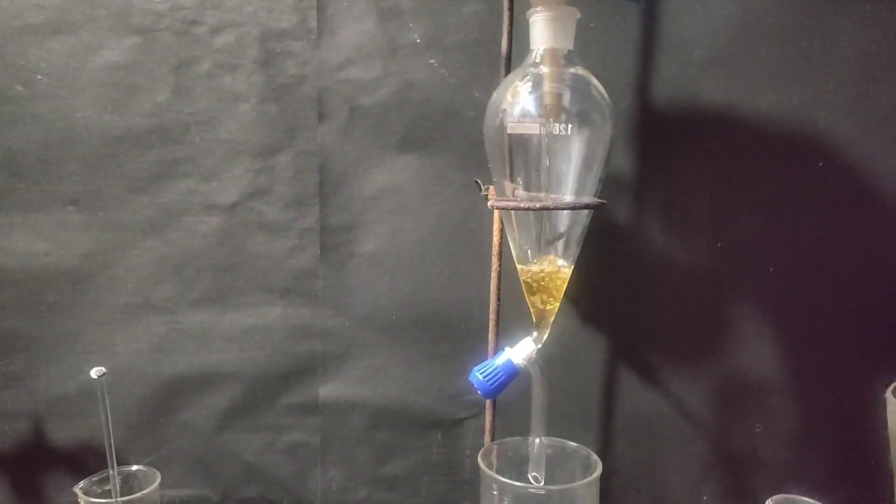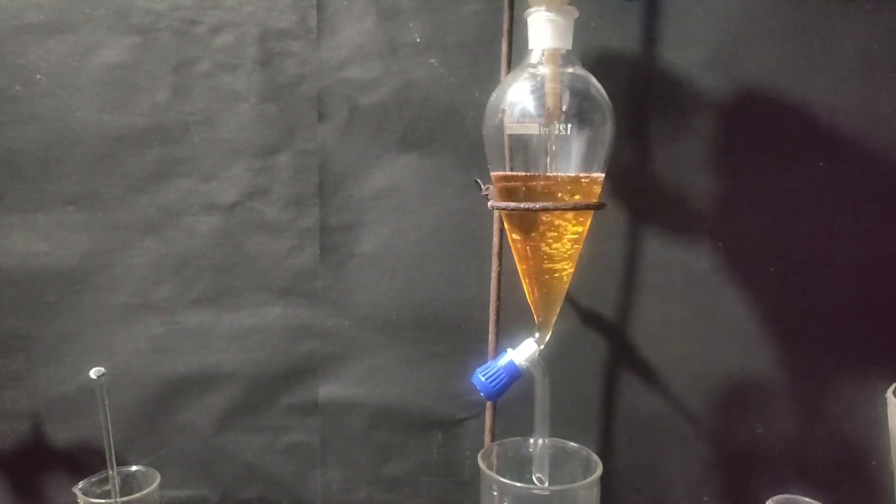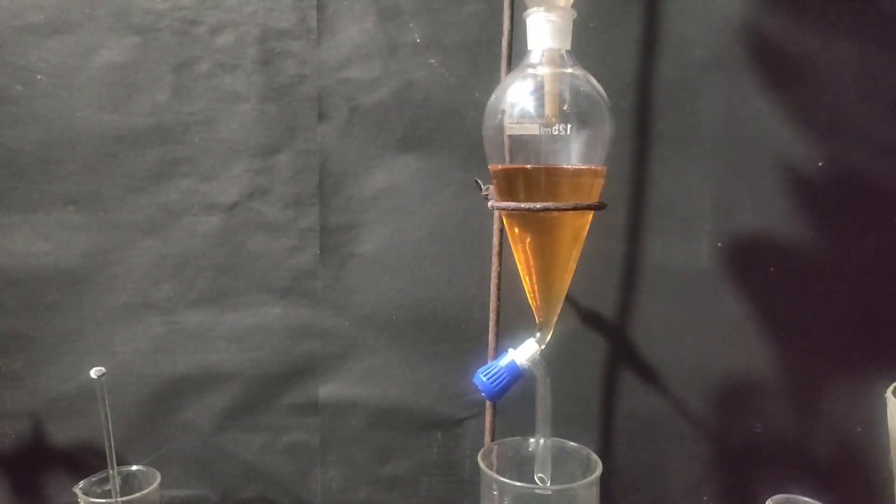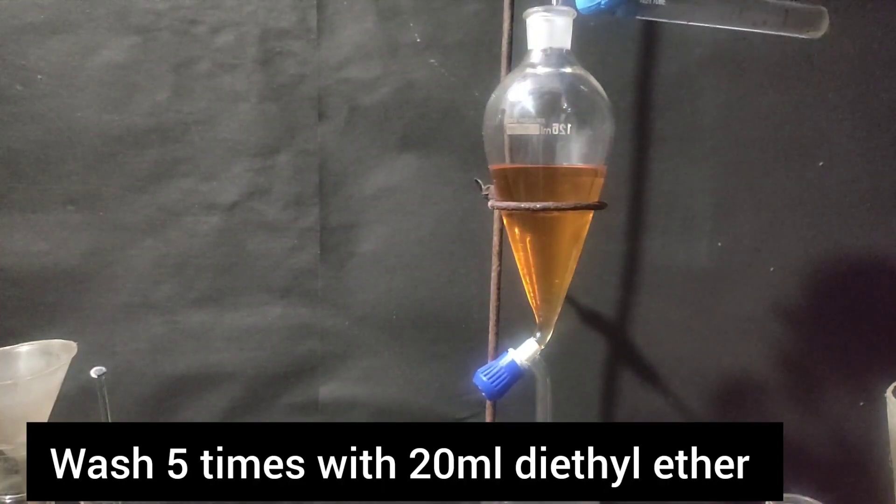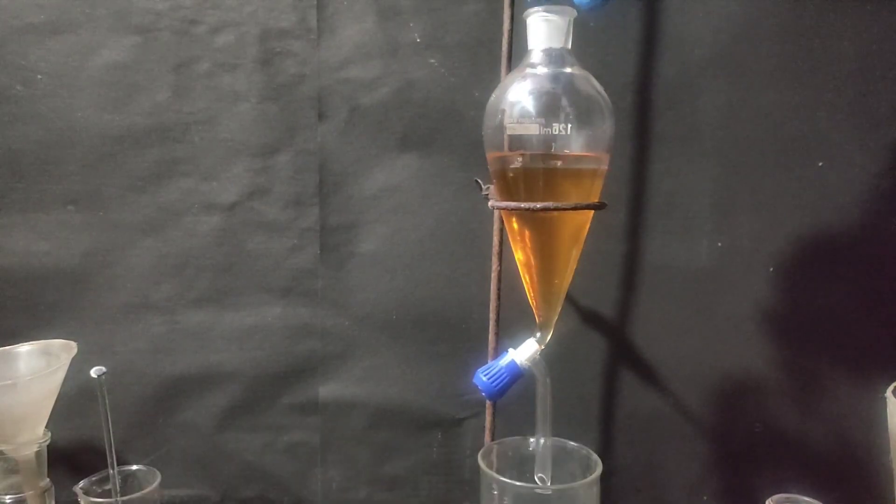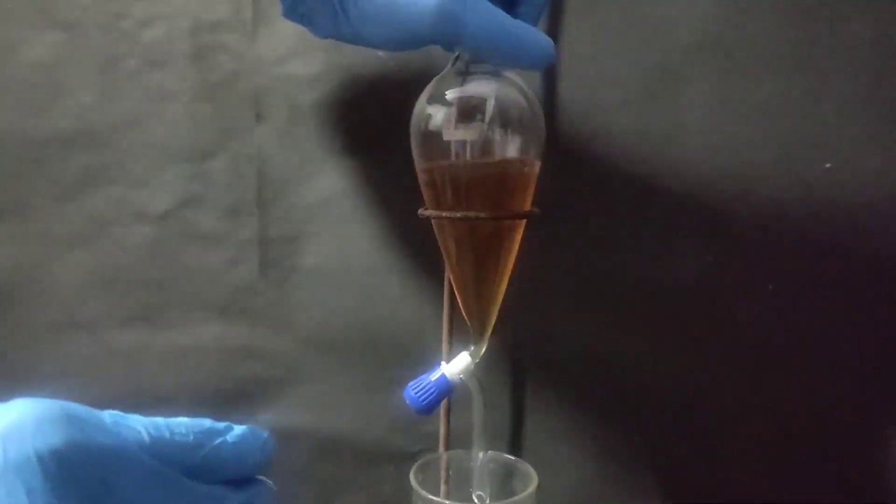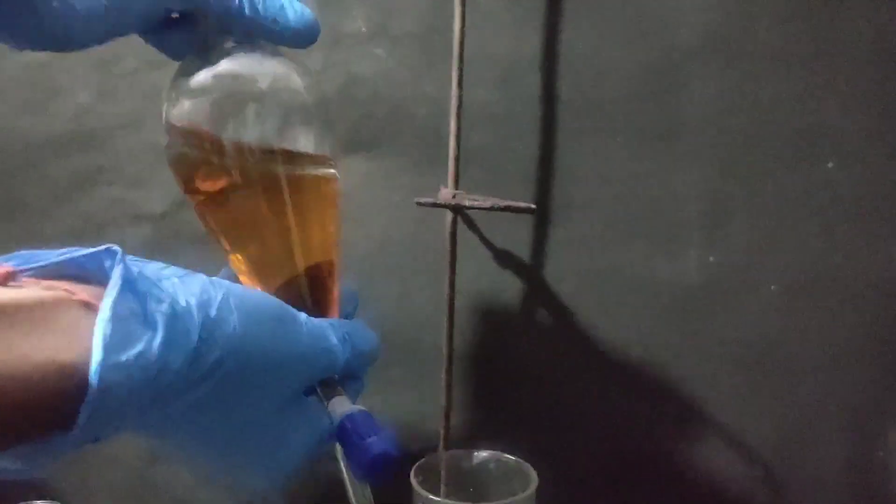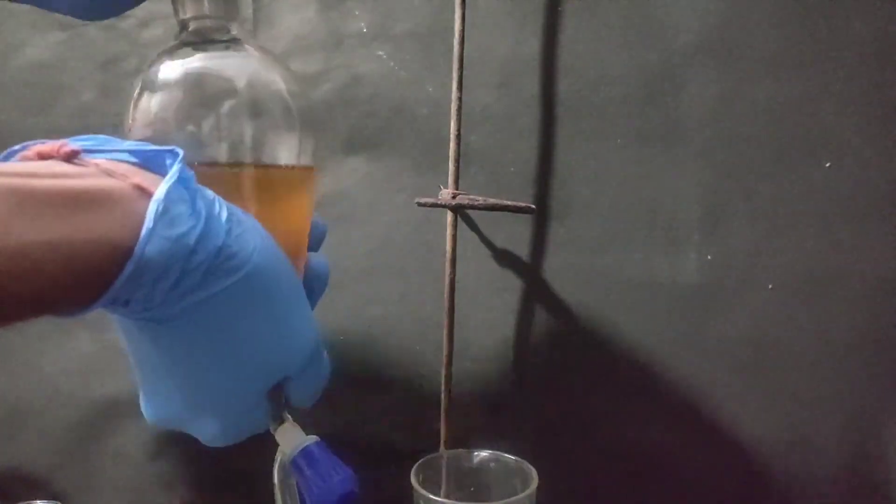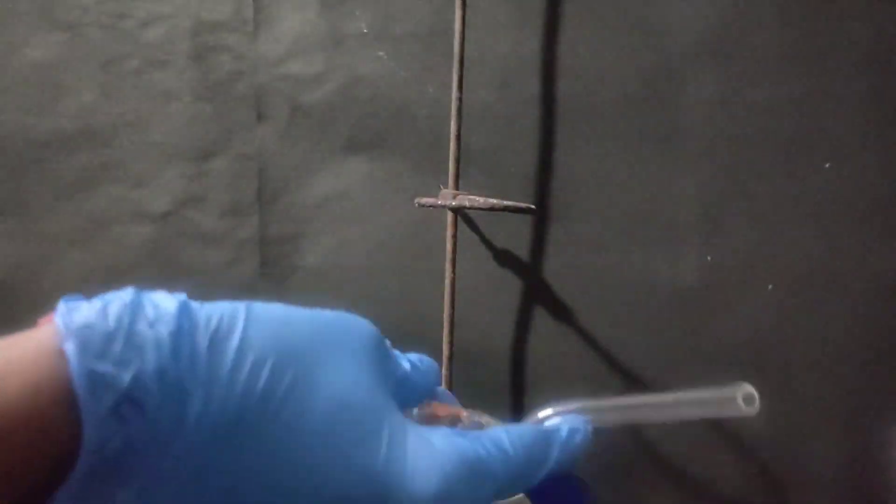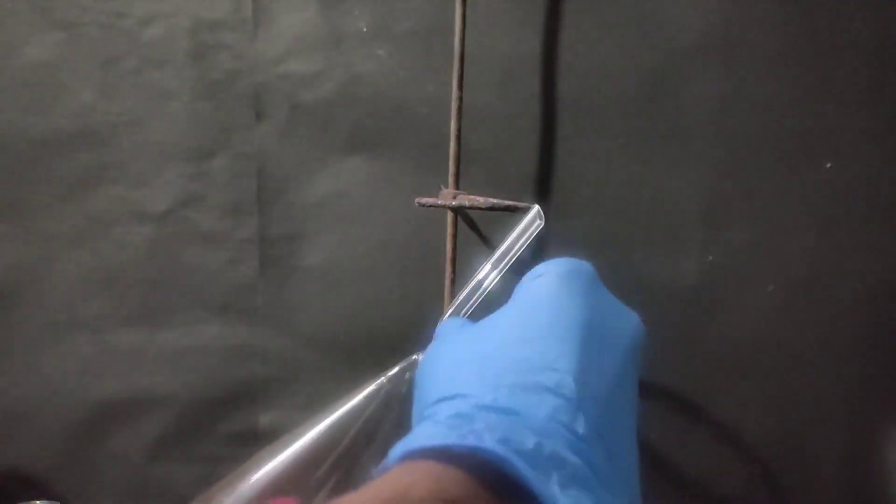Since benzyl alcohol is slightly soluble in water it has to be extracted 5 times with 20 ml diethyl ether. For time sake I am showing only first extraction. I poured 20 ml of diethyl ether in the separatory funnel, capped, shook and vented several times and the layers were allowed to separate.